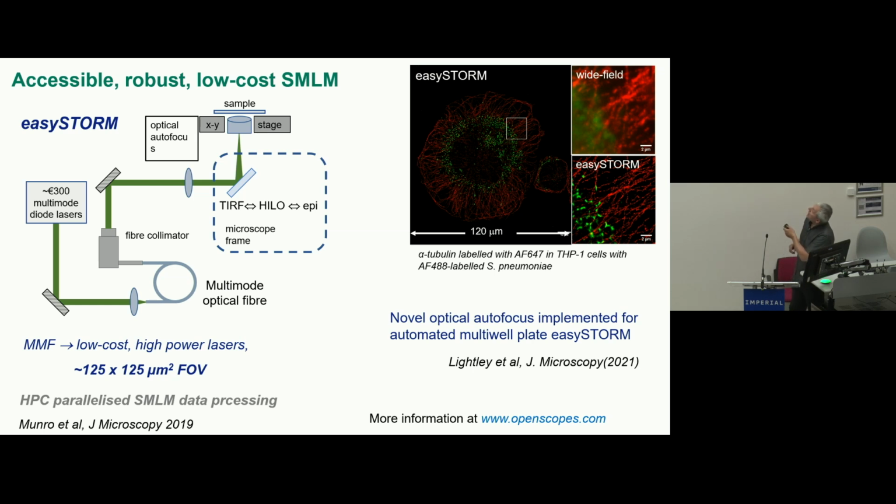And finally, the sample has to be embedded with chemistry. You make sure that the oxygen in the liquid, in which the biological sample is embedded, is completely removed. Then when you have these two conditions of higher irradiation and lack of oxygen, you start to see this electronic effect of every single molecule.